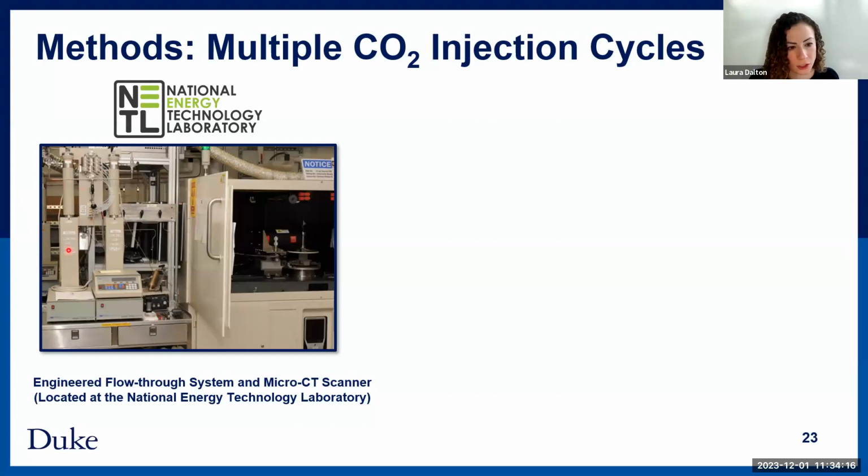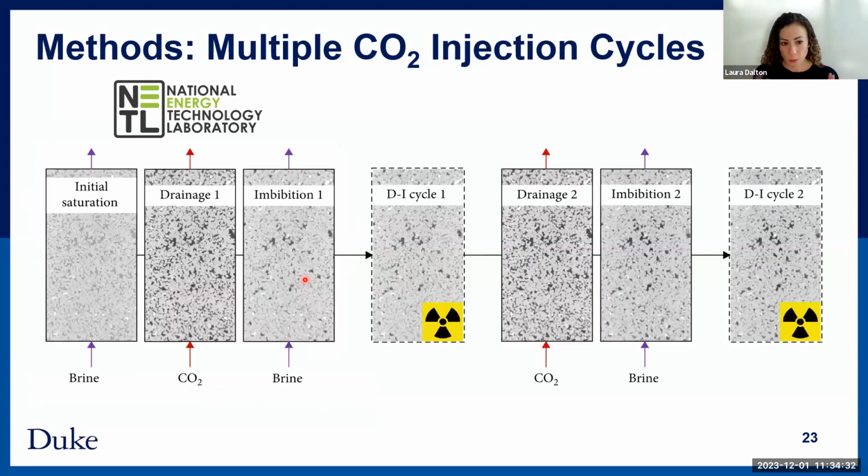And then we have injection and receiving fluid pumps that are interconnected into our X-ray CT device. We can get high temperature, high pressure. To get to supercritical conditions, it's above 31 C and about 1100 PSI, and we can far exceed that with the system.